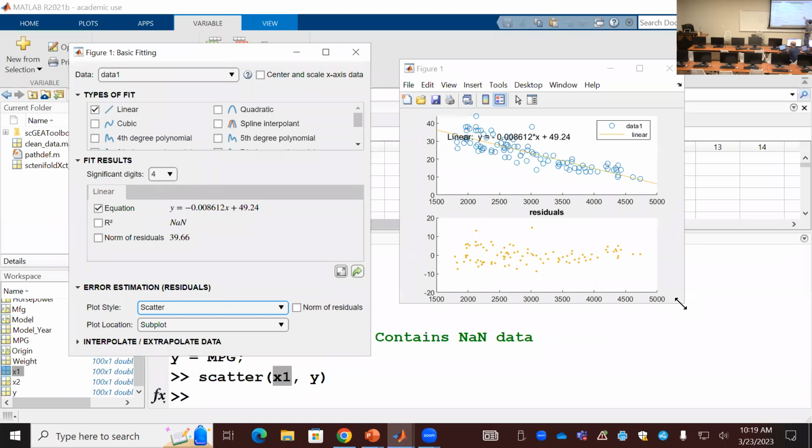So this plot tells you that if it's all close to 0 here in the middle, it means your prediction is really good. Otherwise, if you have dots, which is a residual plot, where the dots jump everywhere, the overall difference from your prediction to the observation is very large. So you have the sum total of this difference. This solution gave you the minimized fitting to minimize all these errors. Is that clear? Okay.